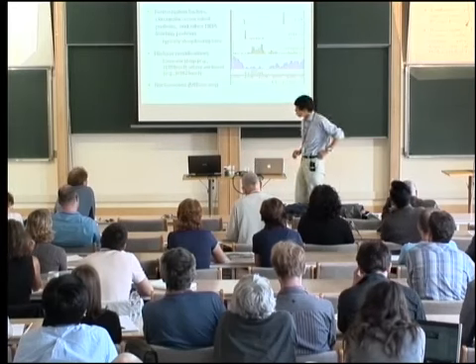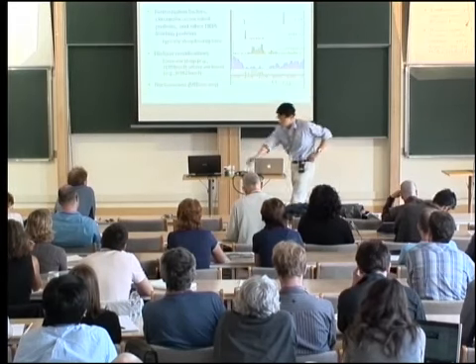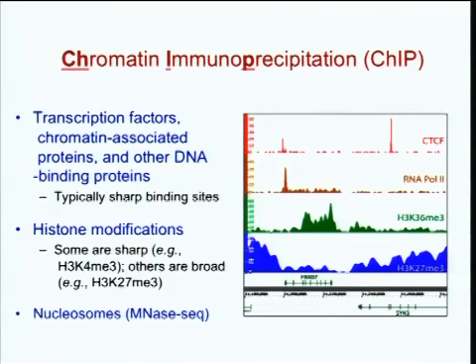All right, so not much more to say here, other than that from transcription factors, you get very sharp peaks, generally speaking. Okay, so those are fairly easy to call. And there are probably about 20 callers out there already. And I'm sure there will be more in the future.